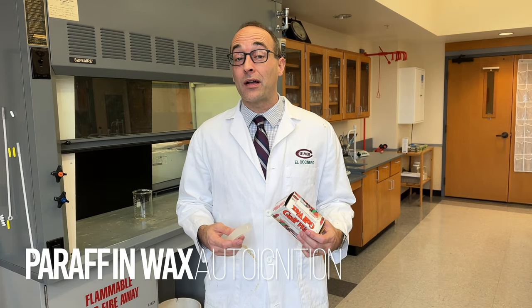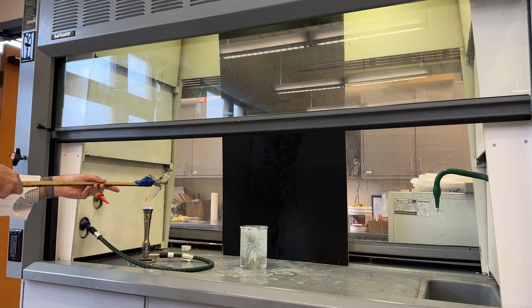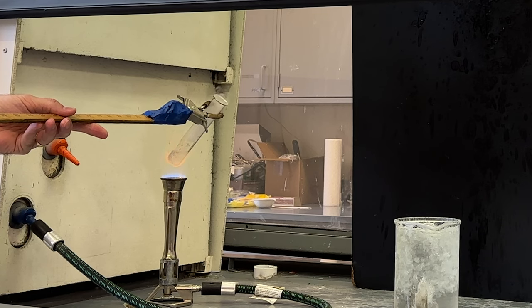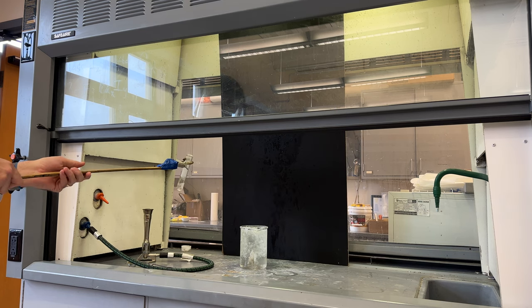The demonstration I'm about to show you and talk about is dangerous and you should never attempt it on your own. The test tube on the left contains a few grams of paraffin wax, and something really peculiar will happen when you heat the wax to boiling and then plunge it into an ice water bath. Let me show you what I mean.